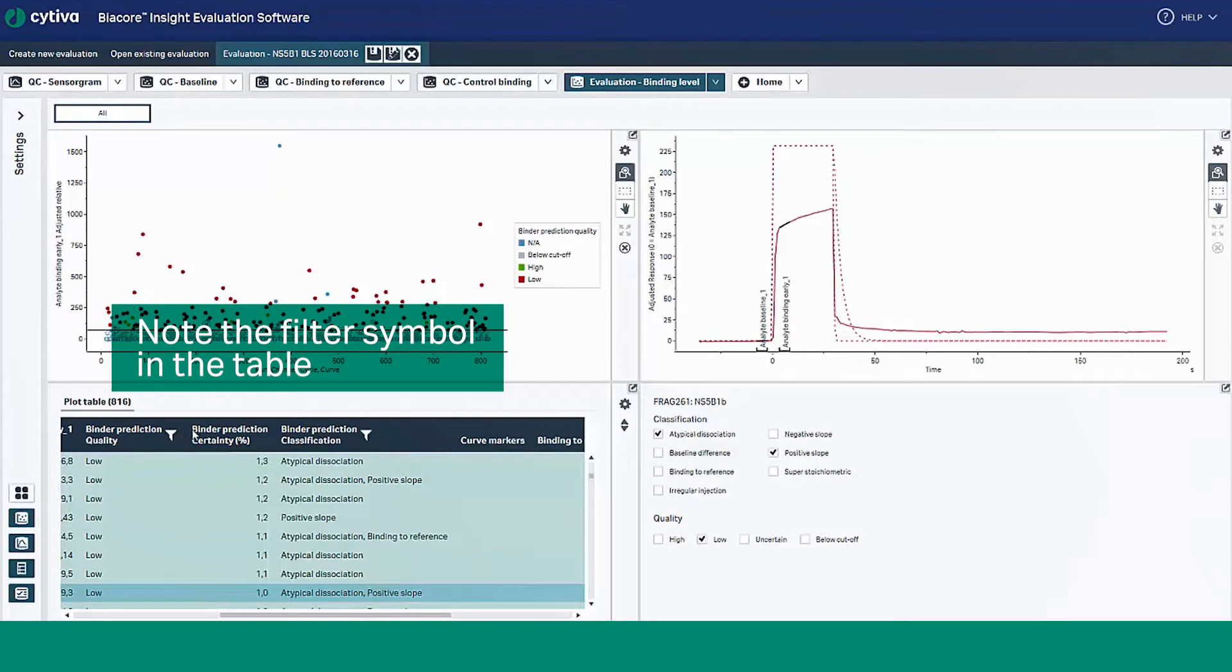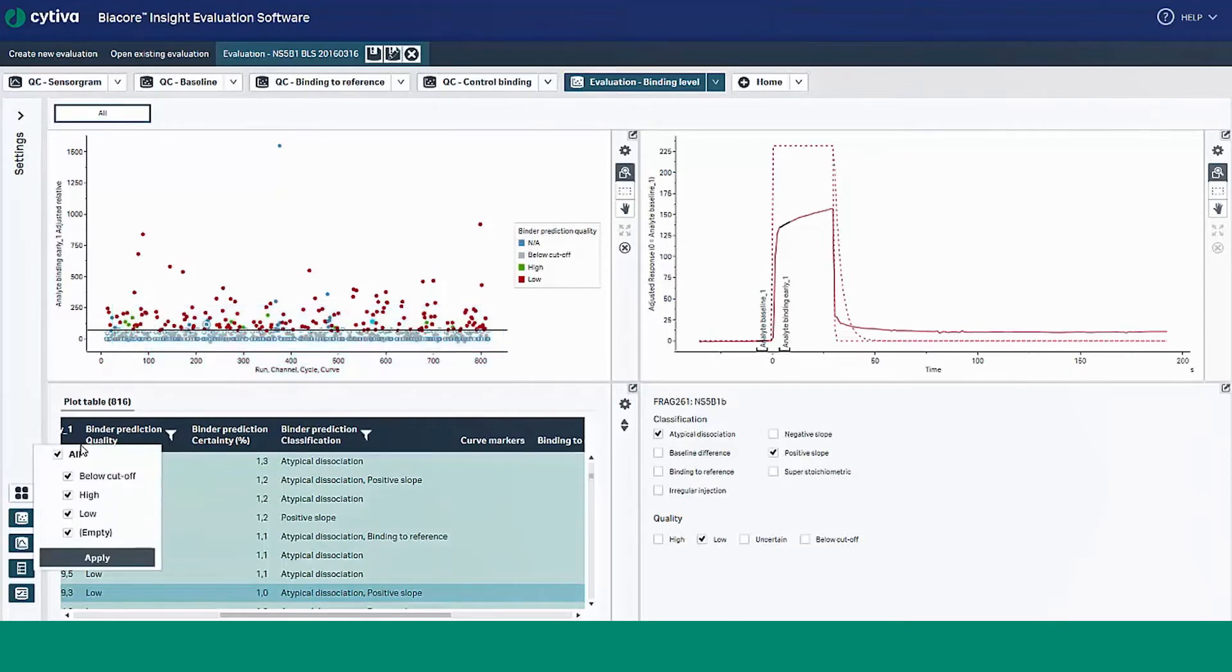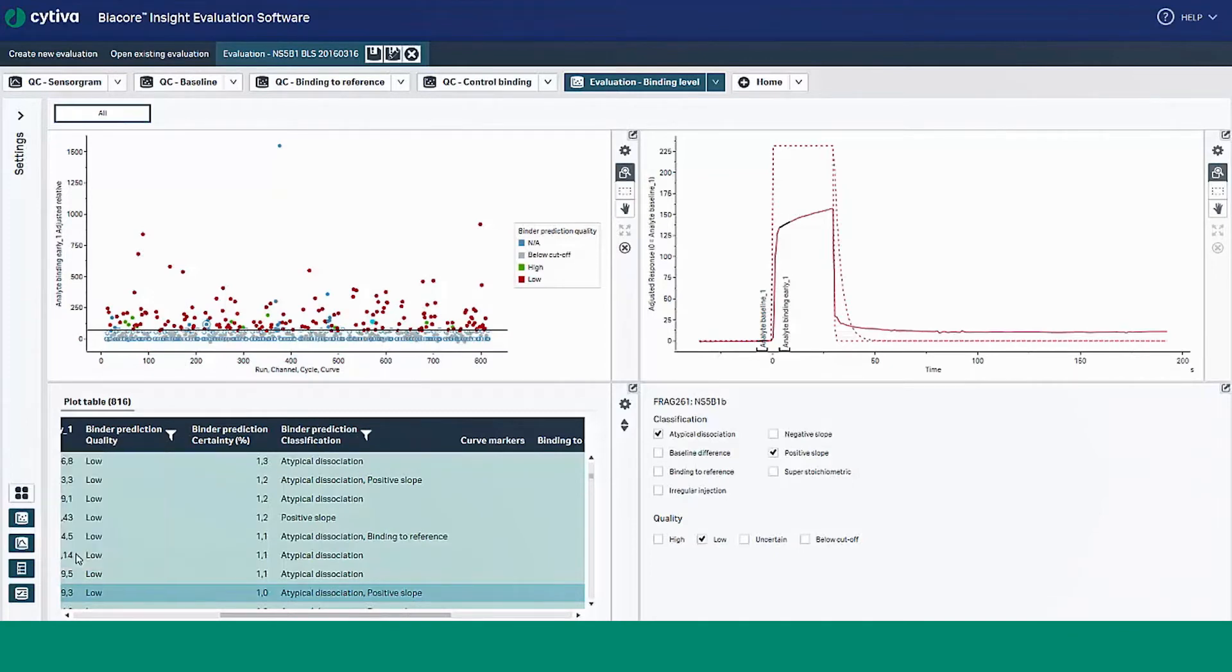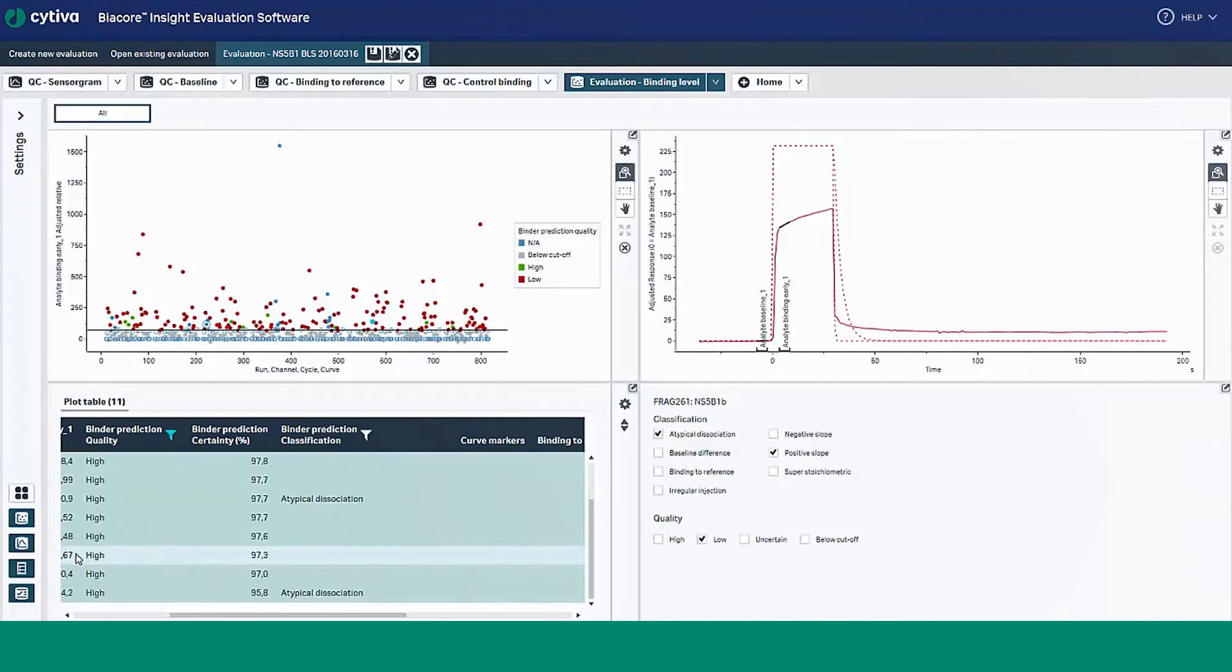Note the filter symbol in the table. You can use this filter to filter certain columns in the plot table, either binding prediction quality or binding prediction classification, to easily focus on certain classification classes.